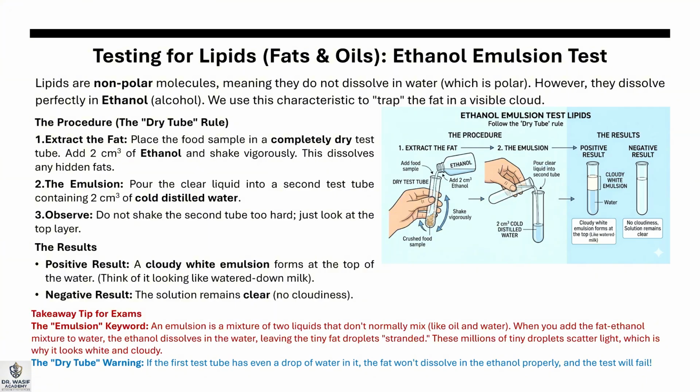Secondly, dry tube warning. Okay, if the first test tube has even a drop of water, I am repeating it, if the first test tube has even a drop of water in it, the fat would not dissolve in the ethanol properly and the test will fail.